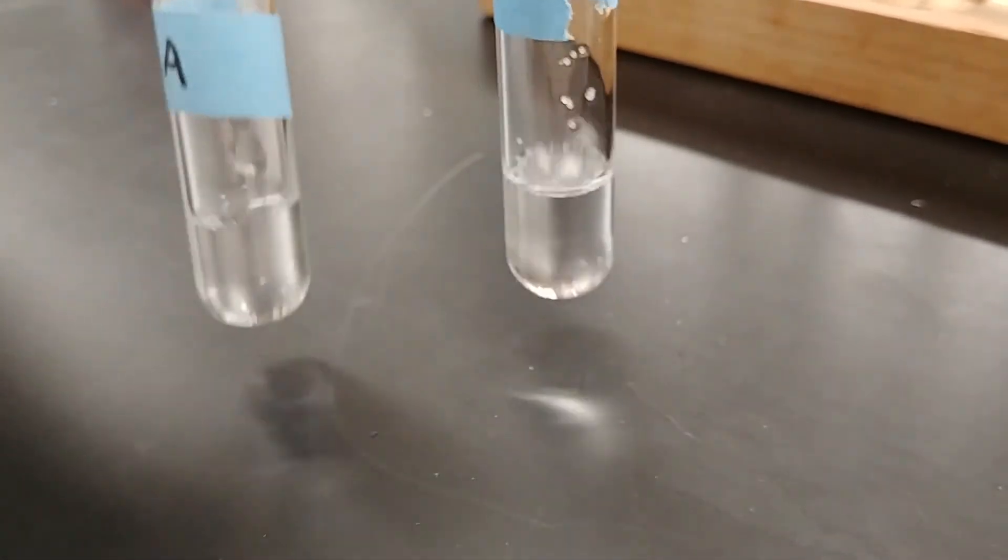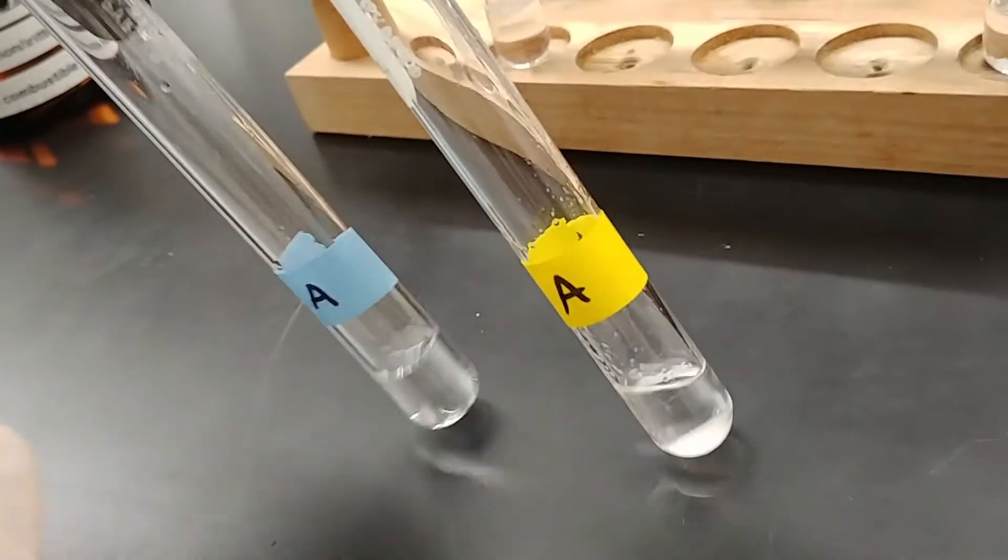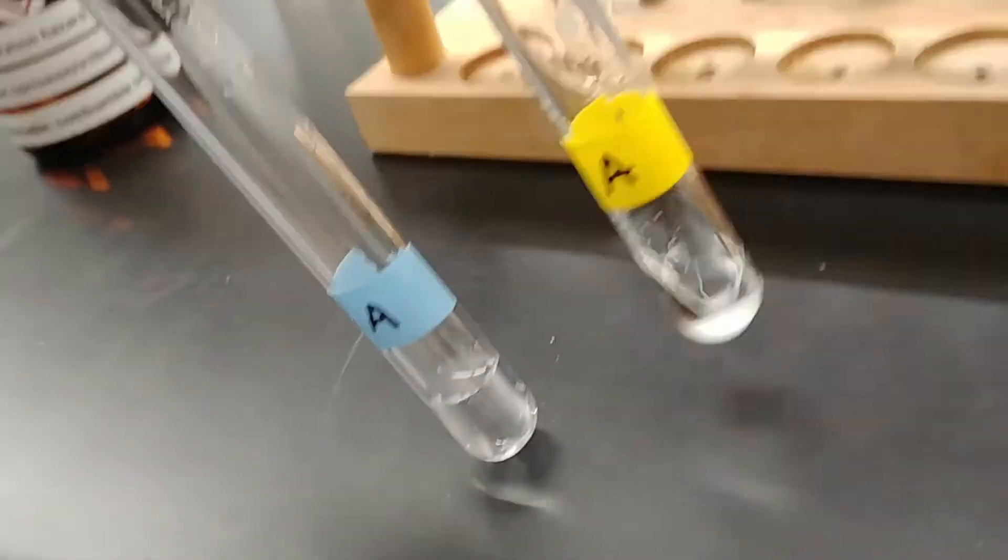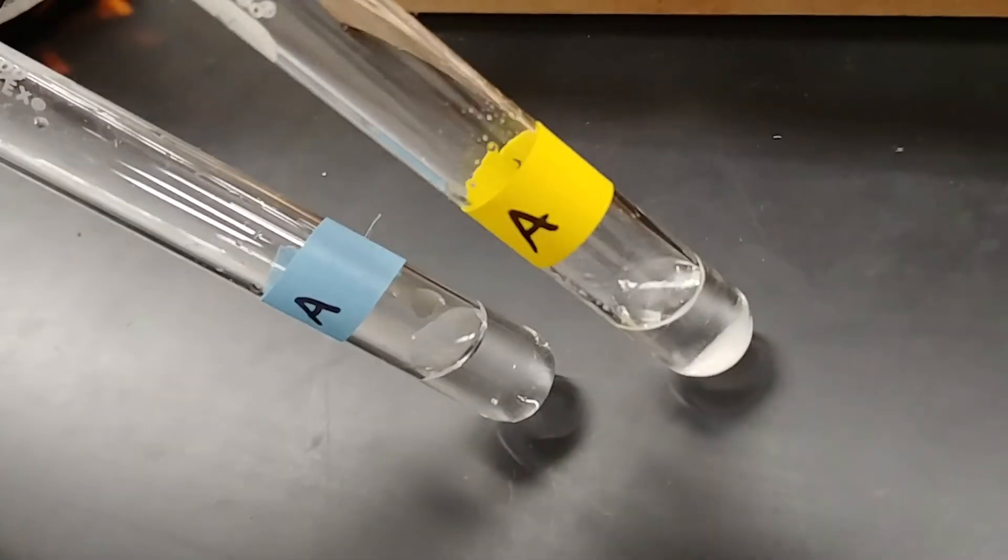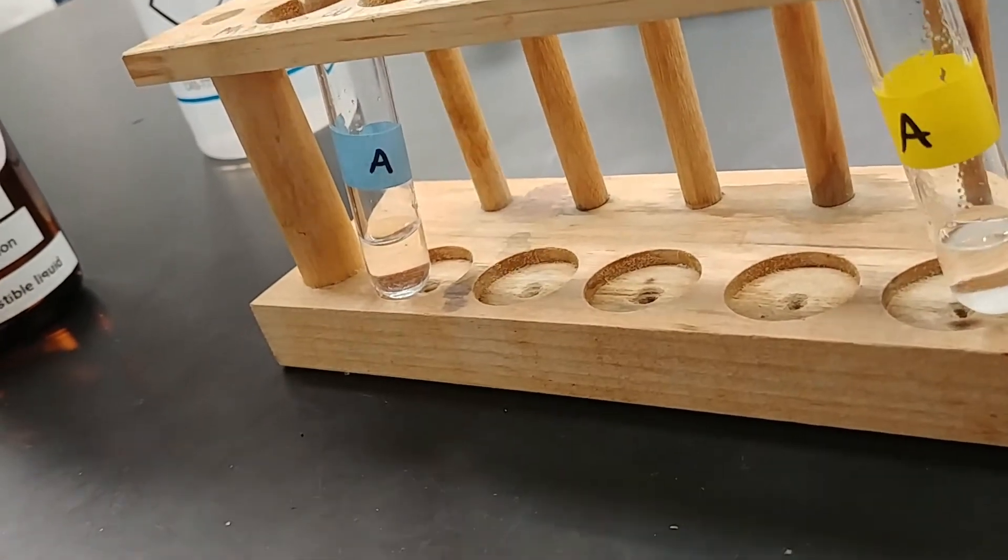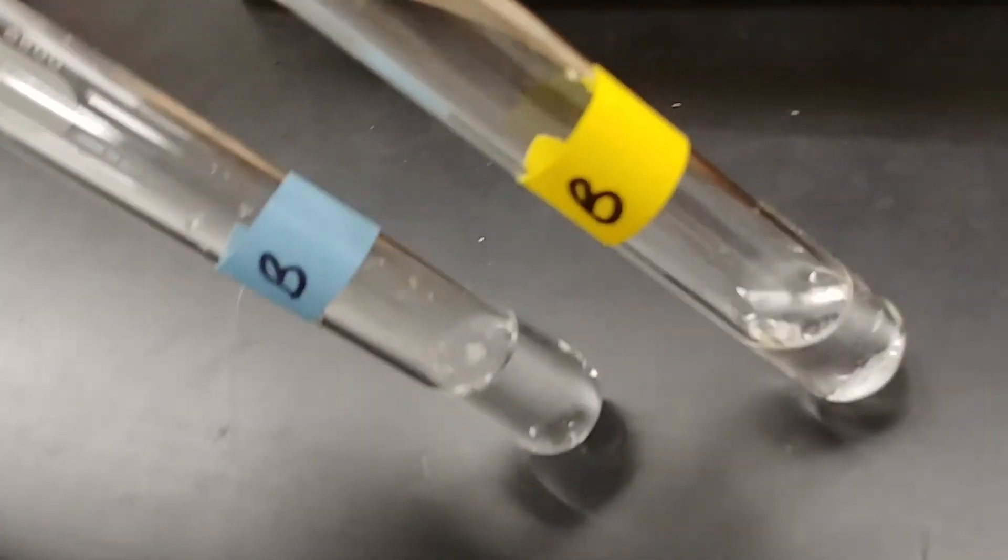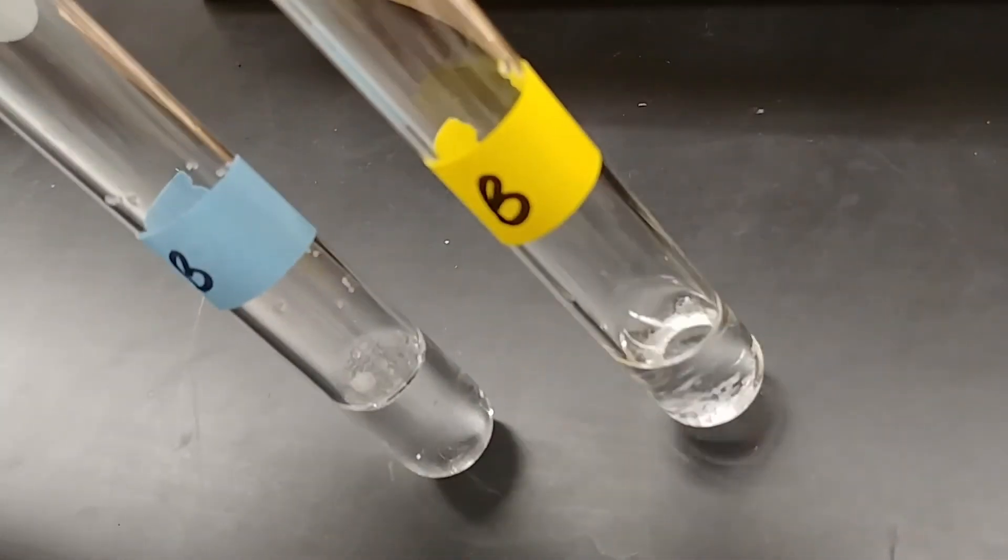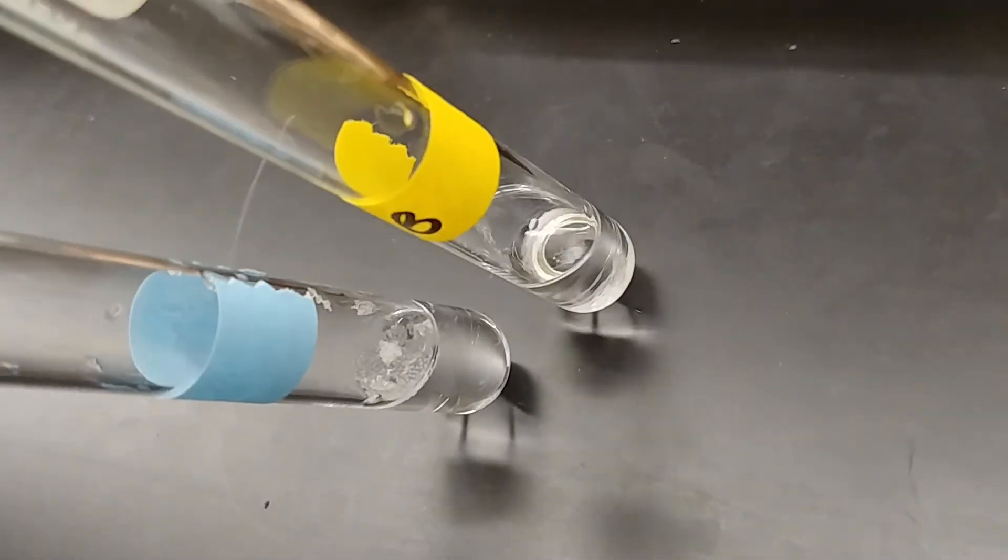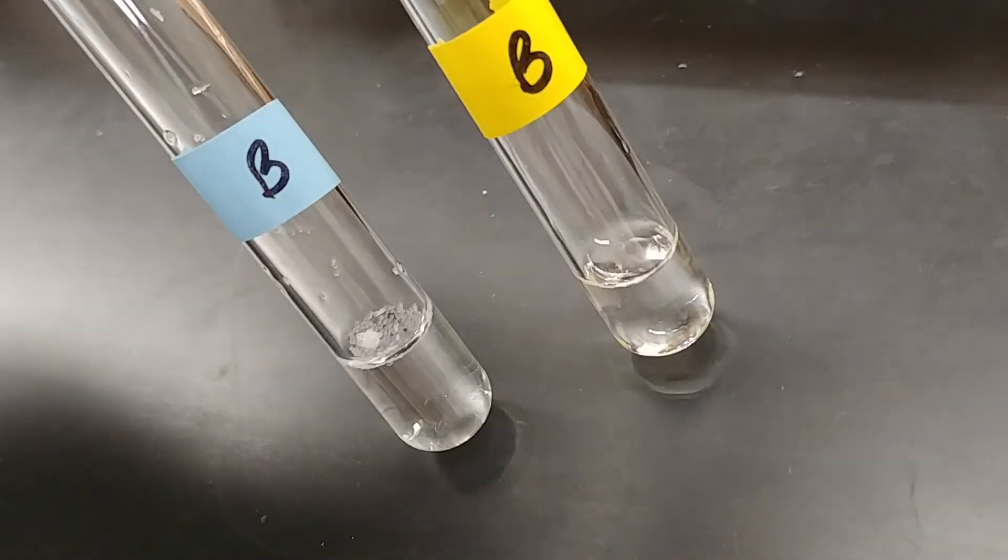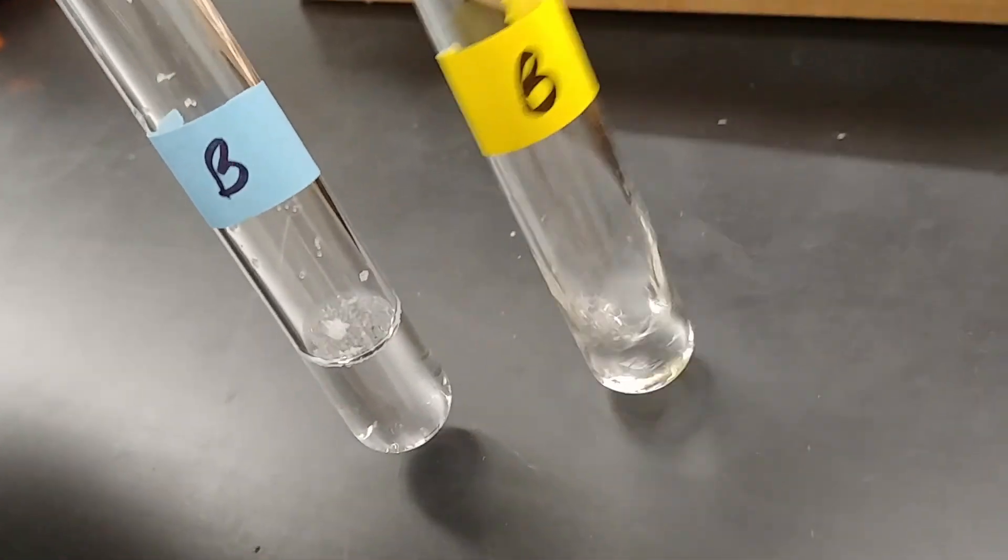So for comparison again, we'll take a look at cyclohexane versus water. So we'll compare unknown A in the water, unknown A in the cyclohexane. Which solvent did a better job of dissolving our solid, our unknown A? And then comparing cyclohexane and water with unknown B, which did a better job of dissolving. We'll see if we can tell which one did a better job of dissolving unknown B.